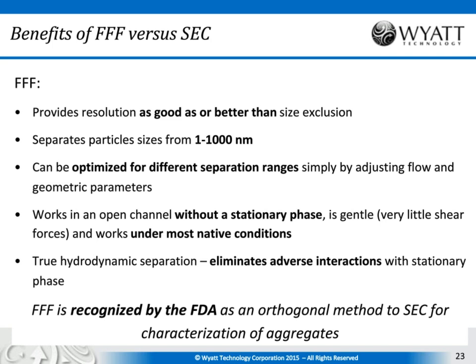Open channel, little shear, works under most native conditions, and will eliminate adverse interactions with the stationary phase. FFF is recognized by the FDA as an orthogonal method to SEC for characterization of aggregates, and so if you are working in a lab which is responsible for characterizing biotherapeutics, it's a useful technique to have in your arsenal.